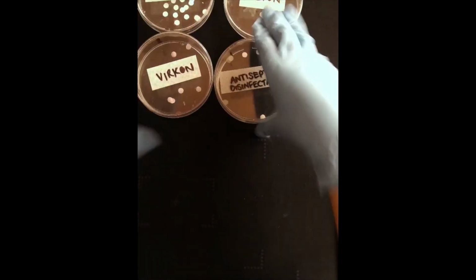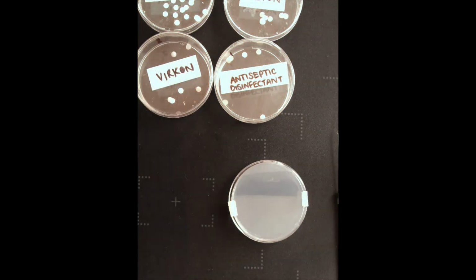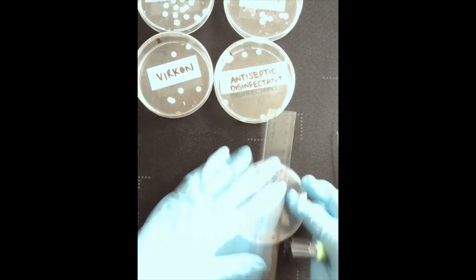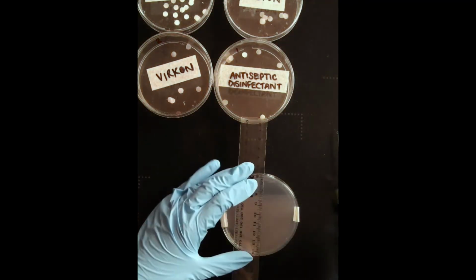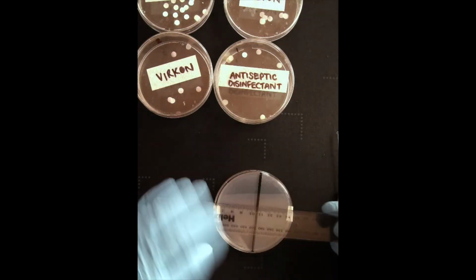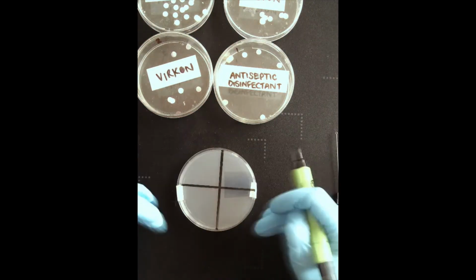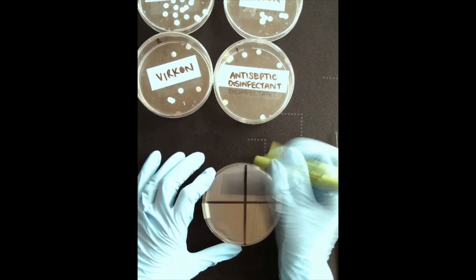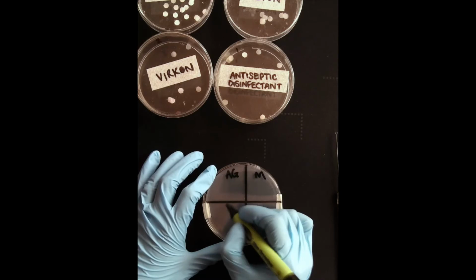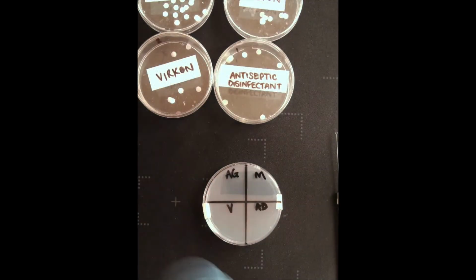Before I start, I'm just going to turn the Petri dish over and divide it into 4 quadrants. Just going to use a ruler to help me do this. I'm dividing it into quadrants so that I can label the antiseptics. So AG will be alcohol gel, M for Milton, V for Virkon, and then AD for antiseptic disinfectant. And I won't get the antiseptics mixed up.